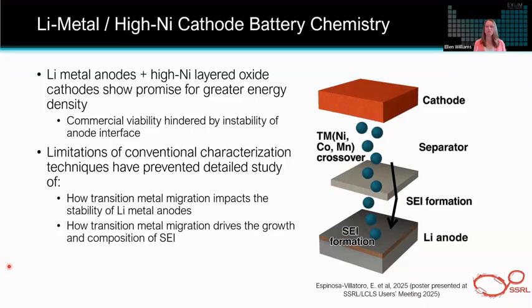And as we've mentioned, there are limitations with some of these conventional characterization techniques to fully understand the stability of the lithium metal anode and how this transition metal migration might be impacting the SEI layer, the solid electrolyte interface layer.